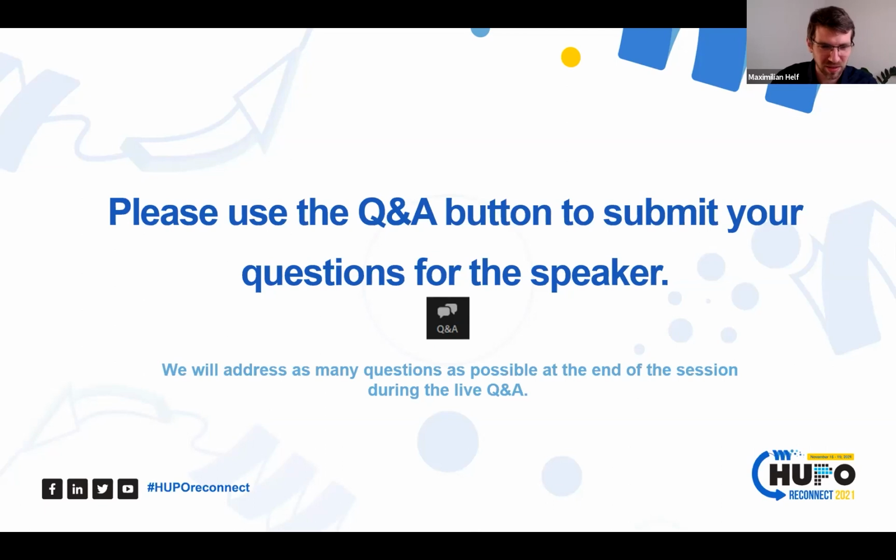While you can still submit questions for Erwin, maybe let's start with a question for Tekira. How does SpectroMine deal with large TMT experiments using blocks?